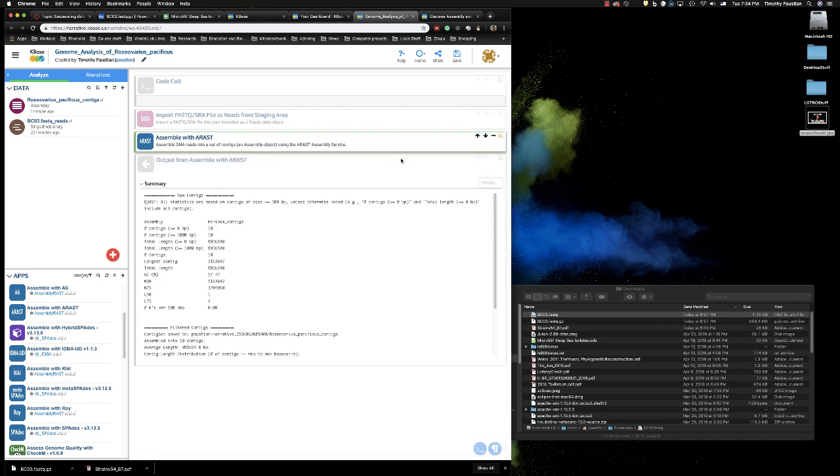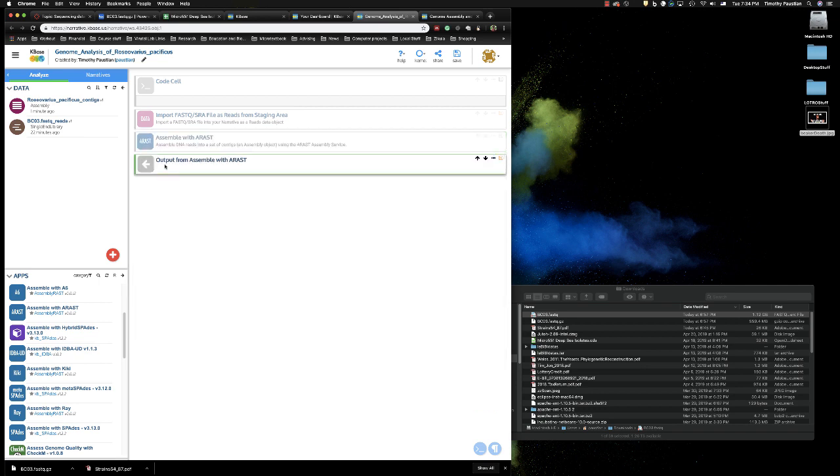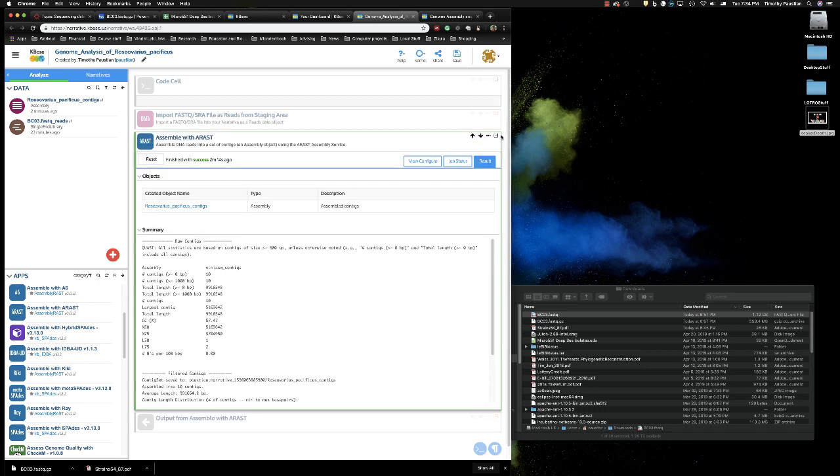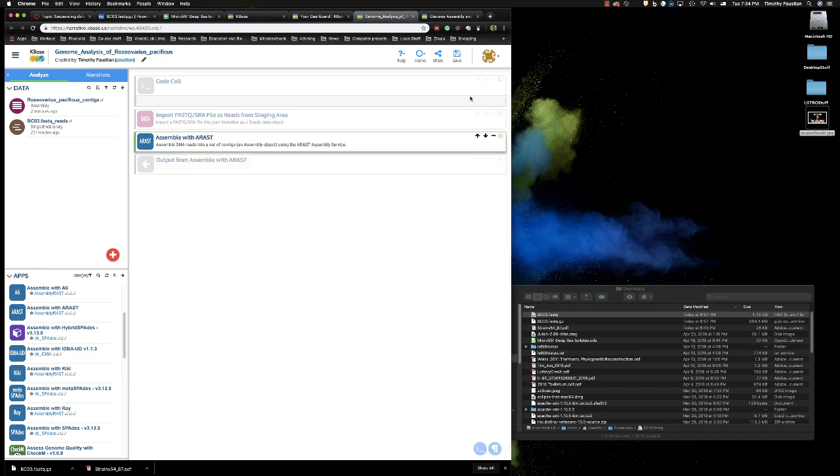Now we have our assembled genome. We can take that data. All right. So we've got that data. We close it down.